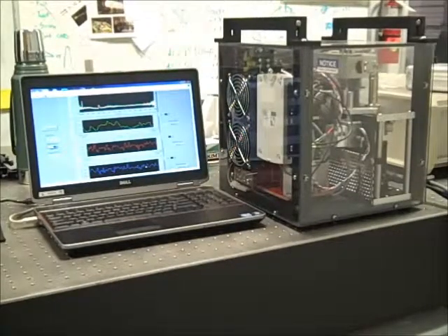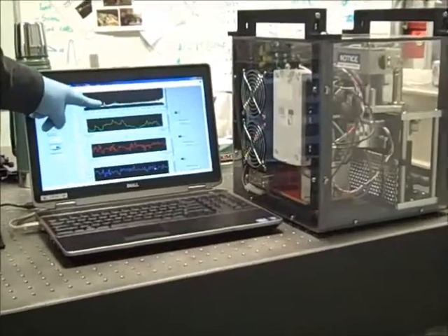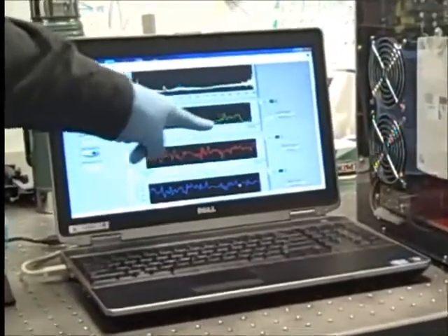In the computer display, an instantaneous spectrum is shown on top, and a time history of concentration is shown below for three different species.